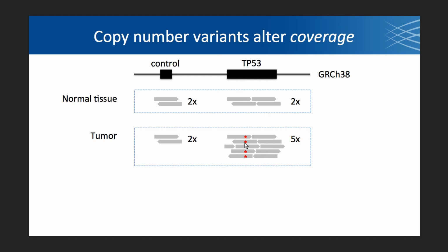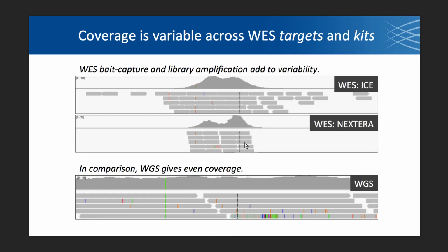We also assume that there isn't bias towards sequencing contexts and sequencing methods. But if there is any inherent bias, this bias will be systematic, and we can account for this bias. So what do I mean by systematic bias?